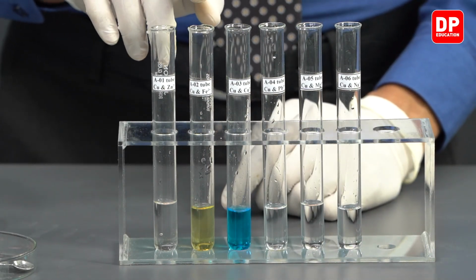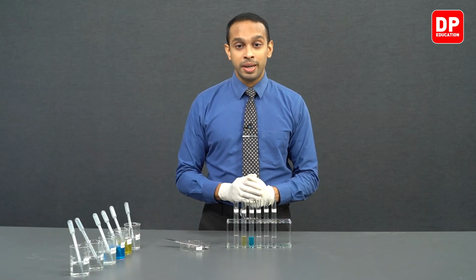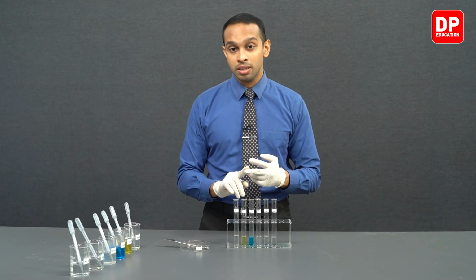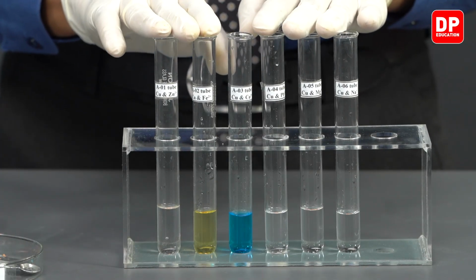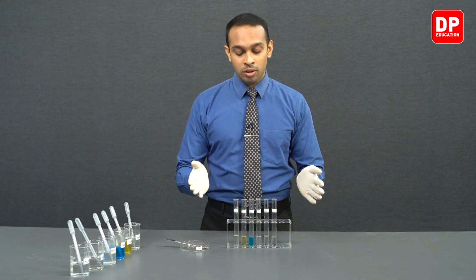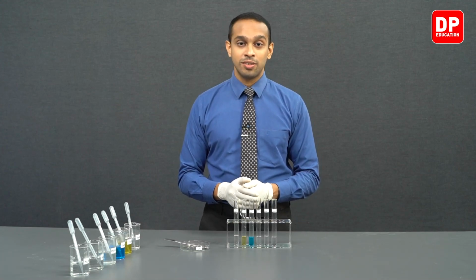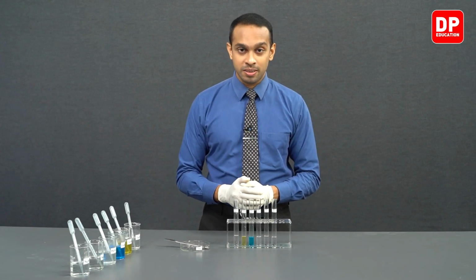indicating, when you compare the metals that are present here in the ion form, sodium, magnesium, zinc, ferrous and lead, all of these metals were more reactive than copper, right? So all of the elements or the metals that we have over here are more reactive than copper. Copper is the least reactive metal out of the metals that we have here in our experiment.